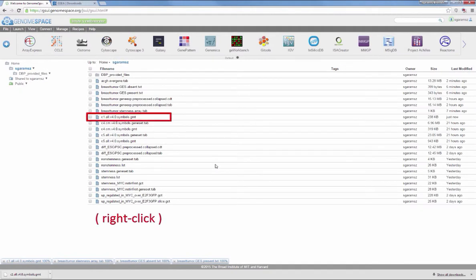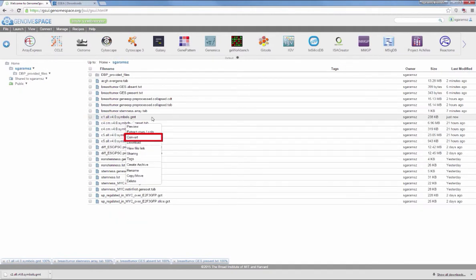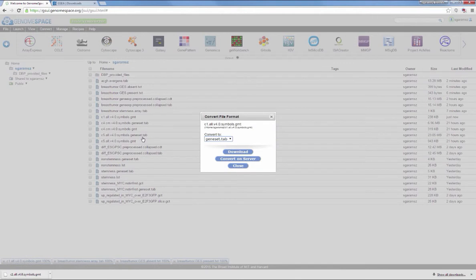Right-click the newly uploaded C1 file and choose Convert. Ensure that you are converting to geneset.tab and click Convert on Server.